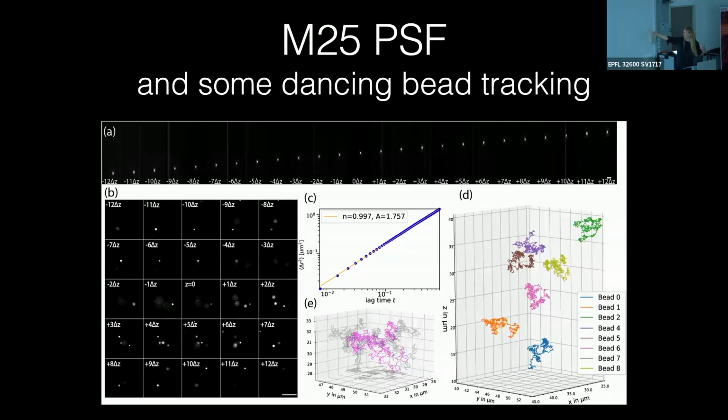And then, yeah, they imaged some beads dancing around in water, and that looked great. They got 25 cameras running at 160 hertz. And after 2 years of soldering and the PSOC controller boards, they can actually do that without dropping frames.